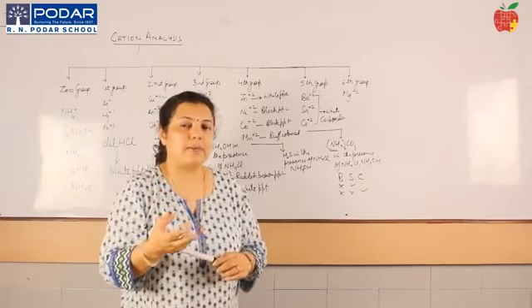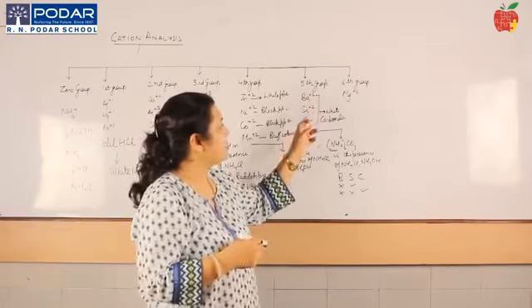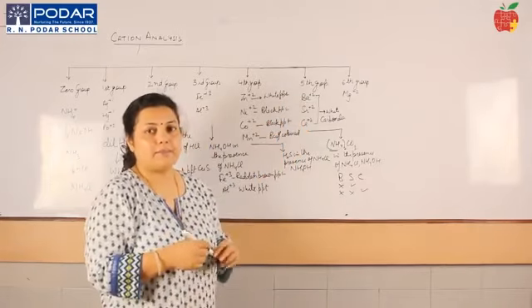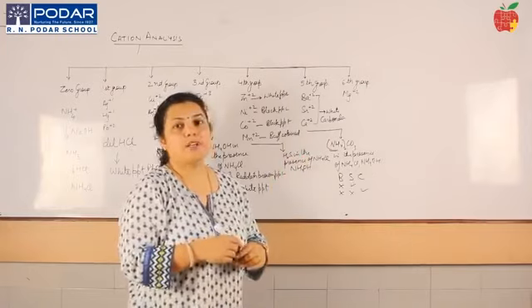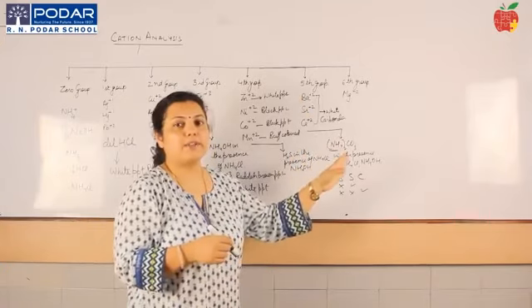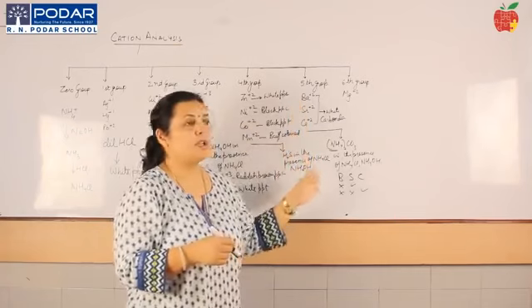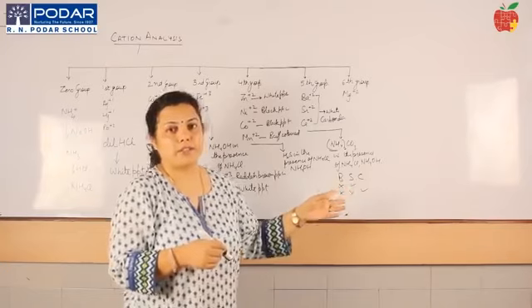Color is imparted to the flame, and the kind of color which is imparted will indicate the presence of barium, strontium or calcium. Color for barium is green, that's apple green color. Strontium is your crimson red, which is rustish in color, and calcium is your brick red or blood red. So if you have these colors imparted to the flame, they will indicate the presence of your barium, strontium or calcium. Once you have done the flame test, it is easy to perform the confirmatory.